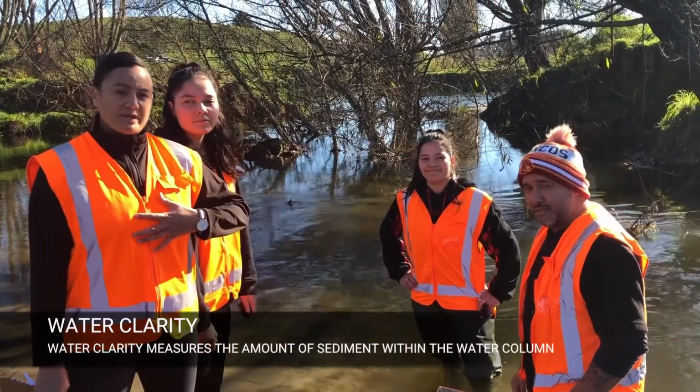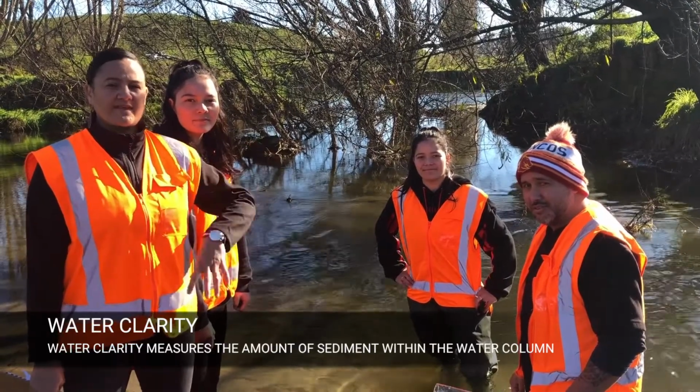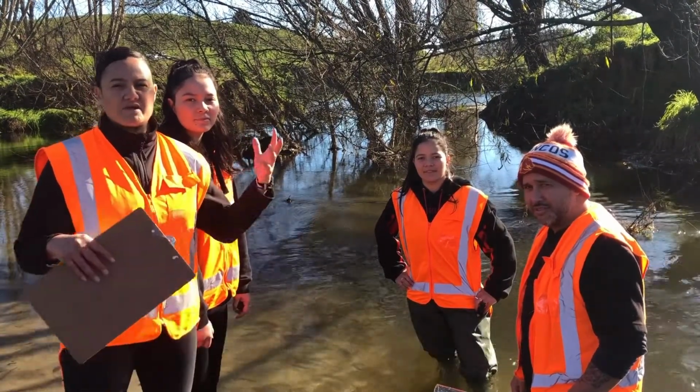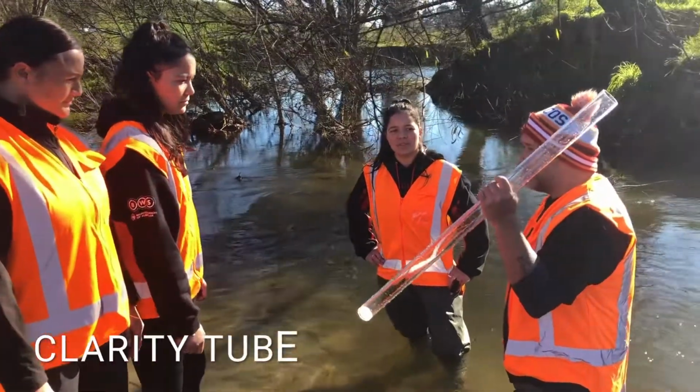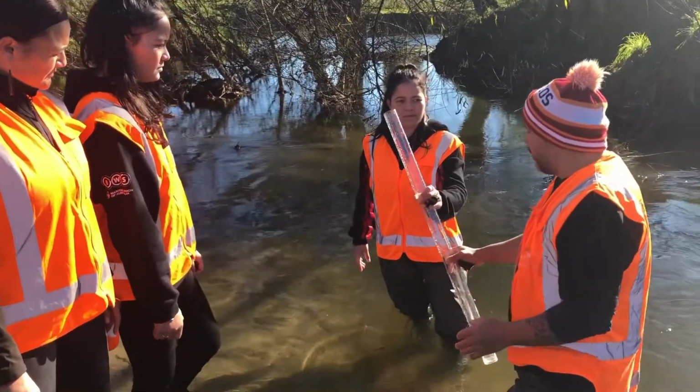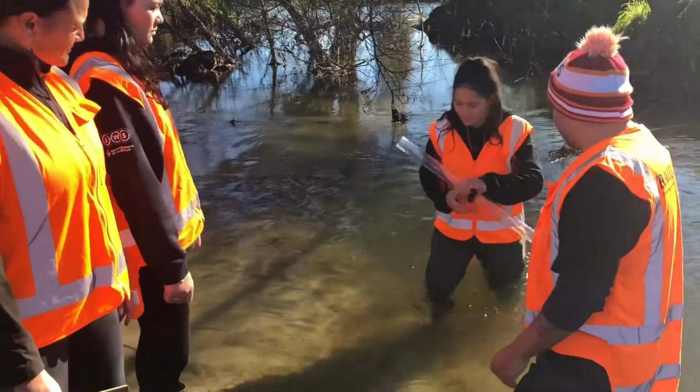So now we're going to measure the clarity of the water, and that's really important because we can see how much sediment or how much paru is actually sitting in this area of the water. Cool, so what we're going to do, fill up our clarity tube. If you fill that up, just in a nice flowing part of the river.